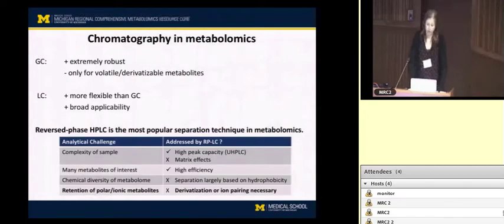In metabolomics, like I mentioned, we use both GC and LC. And I'm going to be talking about, from here on out, exclusively about HPLC. And unless I say otherwise, I'm going to be talking about reverse phase chromatography, because this is by far the most widely used technique in metabolomics.